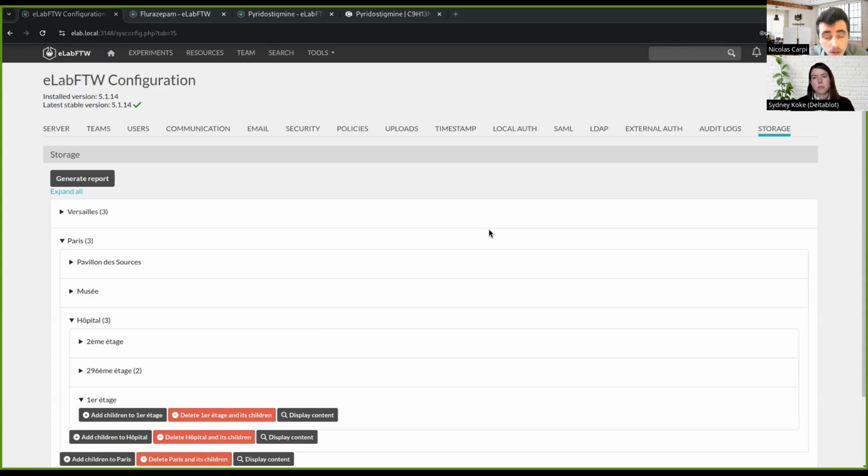At least for now. So we import the flags, like, is it corrosive? Is it toxic to health or toxic to environment or oxidizing, etc.? But we cannot automatically import the SDS because it's just not something that is present on PubChem. So you will have to add them when you have your resource. You add the SDS PDF as an attachment.